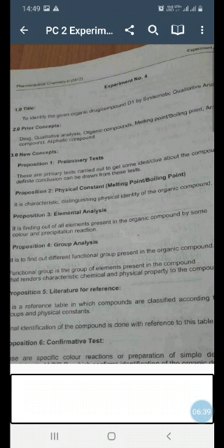For that, what you have to do is just observe the results which you have got in the earlier step, that is, in solubility group determination. Find out which particular groups your compound is a member of, whether one group or multiple groups. Say for example, my compound is a member of group 1, group 3A and group 5. Now, in these three groups, group 1 comes first.